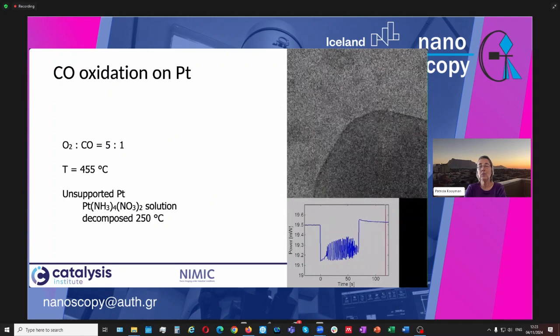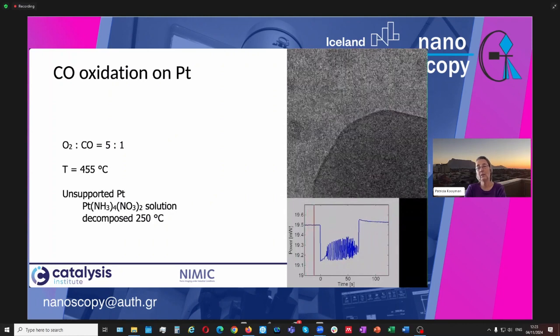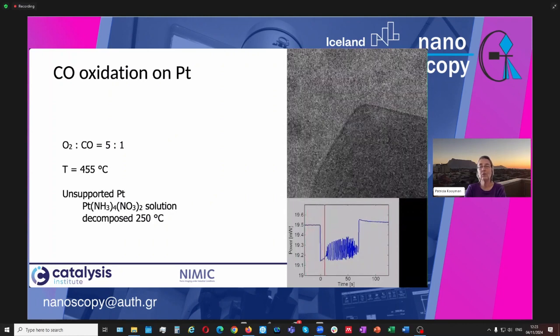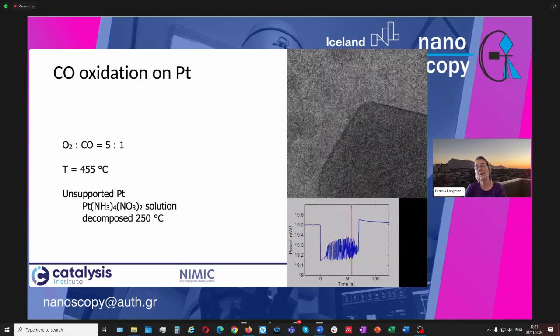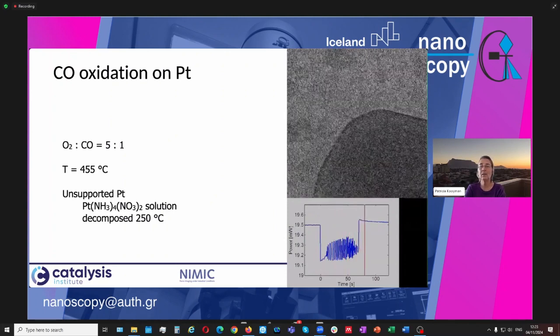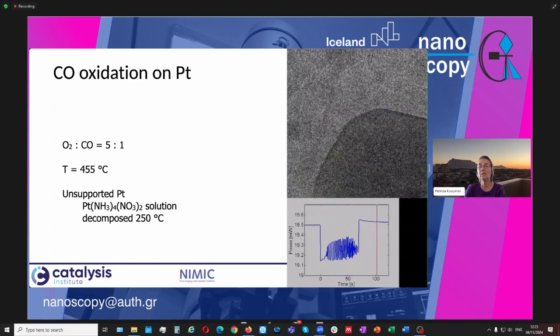So then at first we thought, oh, well, the heater must be broken. So we took everything out of the microscope and prepared a different chip from scratch. And then we saw exactly the same thing. So then we were thinking, okay, well, then maybe it's real.